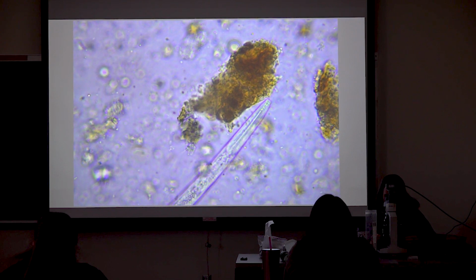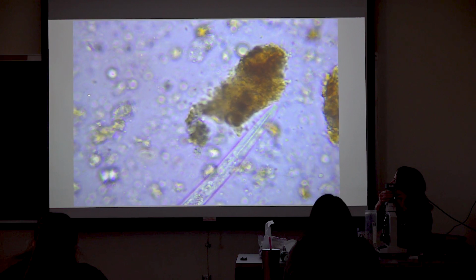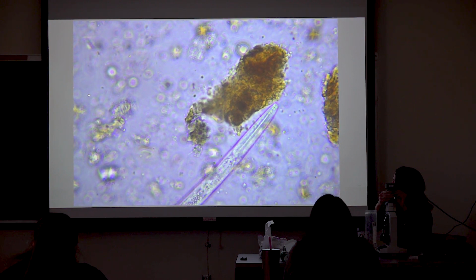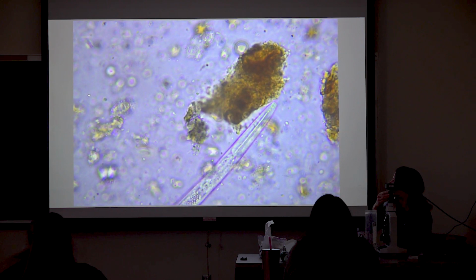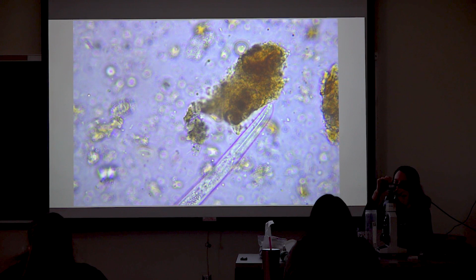Yeah, so the mouth parts are what we look at when we're assessing nematodes. And actually, this might be a good opportunity for me to adjust this camera a little better. So there are lots of different types of nematodes that we end up with in soil. Bacterial feeders are the most common because, again, their food source is bacteria. Ah, see? He's alive! They nap. I told you. I wasn't lying. They do nap.